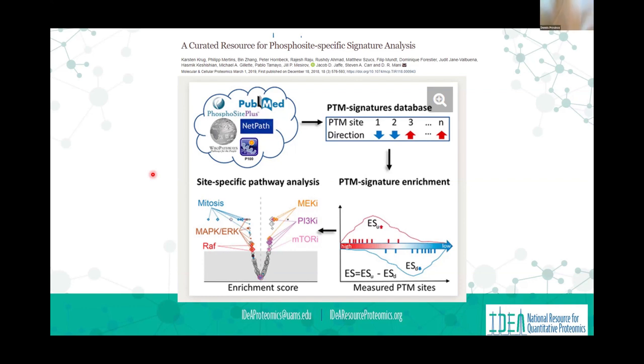The question was how the samples were normalized, if they were normalized to the total protein or to the non-phosphorylated form. And so we normalize to the total protein. I mean, you can look at the abundance of the non-phosphorylated form, but it's difficult to directly compare the intensity of a non-phosphorylated peptide with a phosphorylated peptide. The non-phosphorylated peptide is detected in a separate experiment, the experiment where we're looking at just the protein.